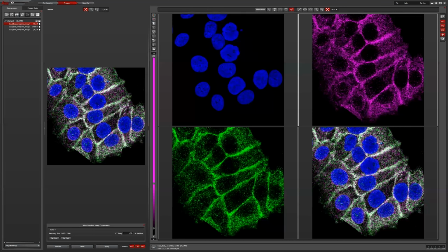So when you want to perform this 2D deconvolution, the first thing you have to do is to export the fluorescent images from the microscope software. They need to be exported as raw grayscale TIFF files. That means you'll export 3 separate TIFFs per image set. So you'll have the Hoechst 33342, and that will be as channel 00. The Atto 565 will be as channel 01, and Atto 647N as channel 02.